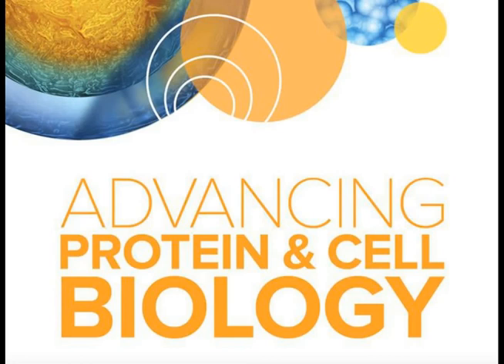The confocal will give you improved segmentation because it's removing a lot of the out of focus light. And then the depth or the 3D size of the object might be extended, so it might be measured as deeper and the volume overestimated in a wide field system. But it's still possible to segment in both wide field and confocal.